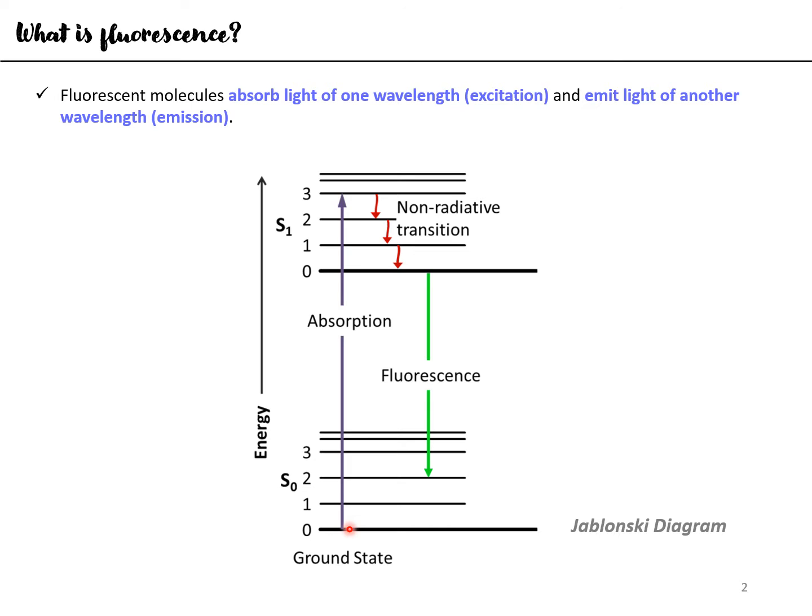So when it absorbs the energy from light, that is photons, these electrons get excited, and upon excitation they will move from this state to the higher energy level, which is the S1 state. Now within the S1 state, your electron can move to either of these levels. It can go to either this 0 level or 1, 2, 3, or whichever of these high levels.